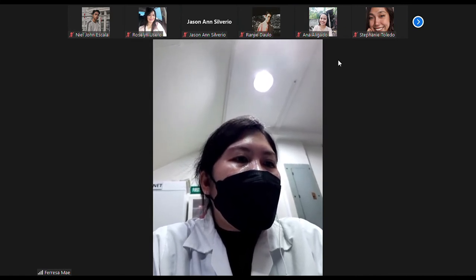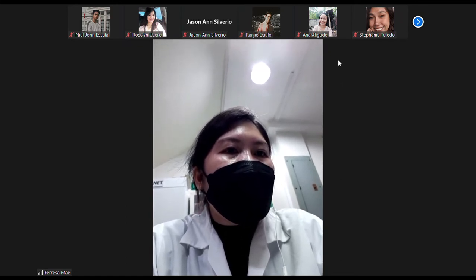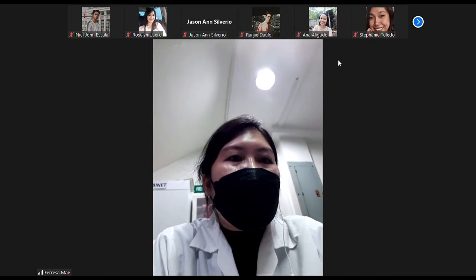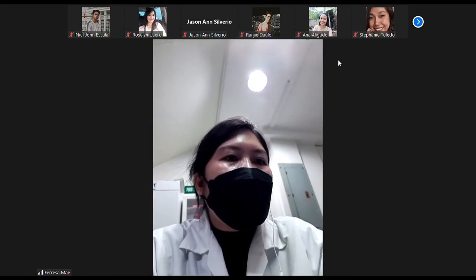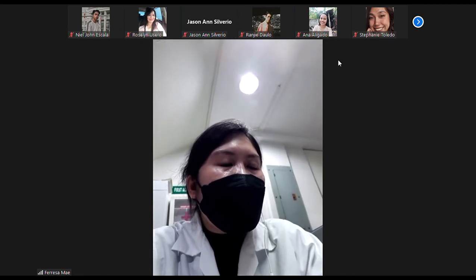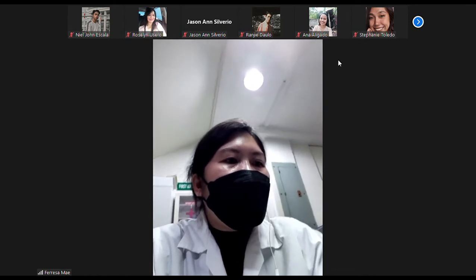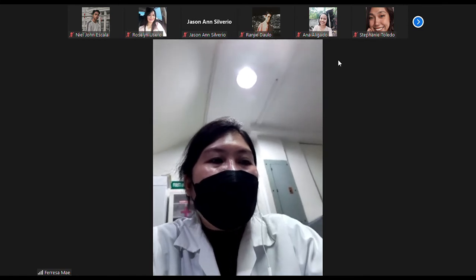And the disadvantages are, number one, heating of a moist organic substance causes, in addition, volatilization of material and formation of gaseous product by irreversible thermal decomposition of organic components. The second, further weight changes resulting from oxidation phenomenon occur. The third, improperly maintained desiccator and desiccants can cause erratic results from pickup of moisture during cooling. And the last one, formation of a crust that is impervious to evaporation of moisture from the center of a dried sample.